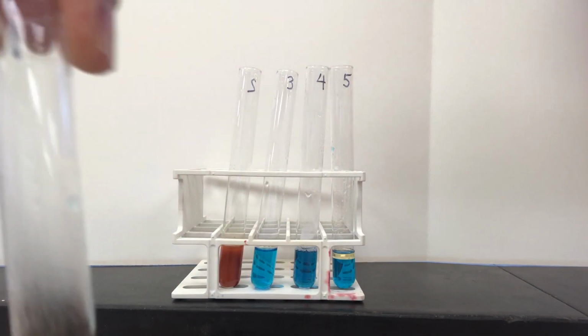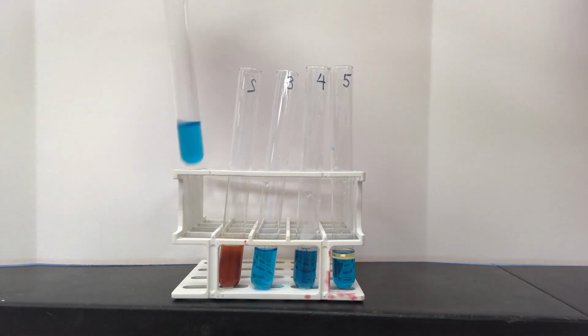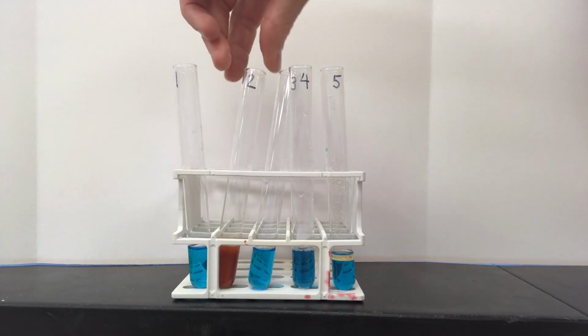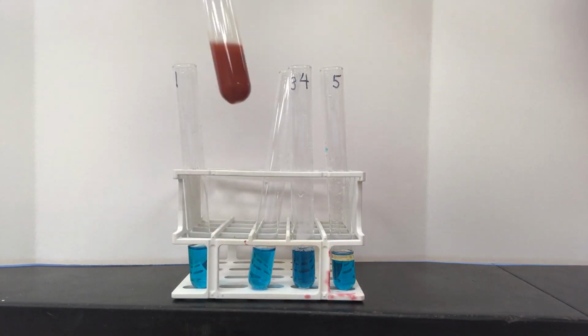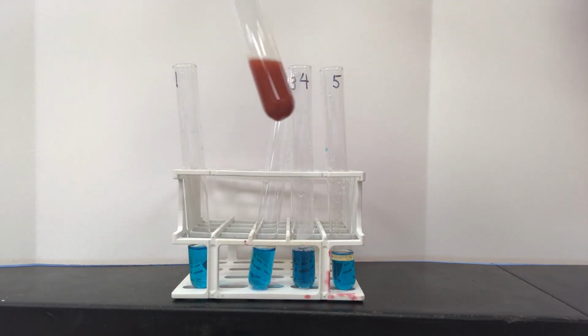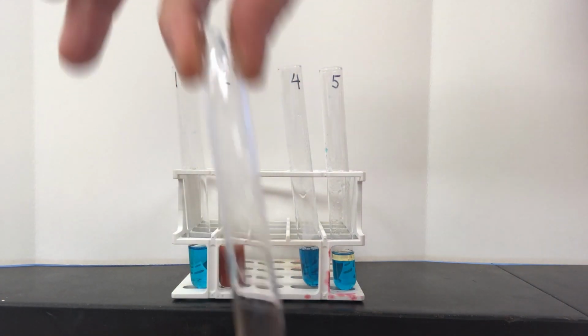Tube number 1, the water, represents your negative control. It should not exhibit any change from before the boiling. This is what a sample would look like if there were no monosaccharides present. Comparing each sample to the water, we see that only test tube number 2 looks different. It's turned a bright orange-red and has become very cloudy due to the formation of a lot of precipitate.